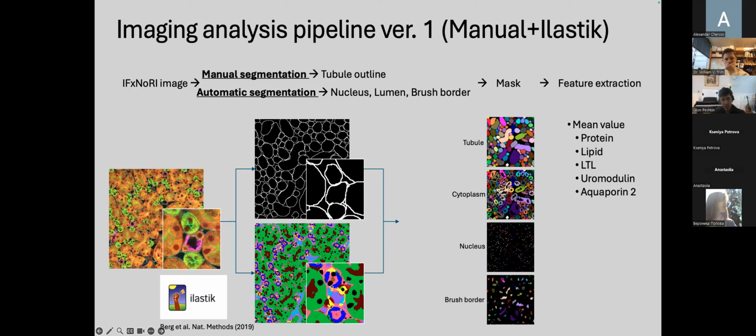Then once you identify nuclei, you imagine it's easier to find cells. Once you identify cells of different shapes, you could assign different cell types, and those could be assembled into structural elements like glomerulus, like tubules of different kinds, and so on and so forth. One aspect that we faced already is that many pipelines or potential collaborators tend to think in this phased manner, right? That you maybe first identify nuclei, then cells, then bring cells together into tubules.